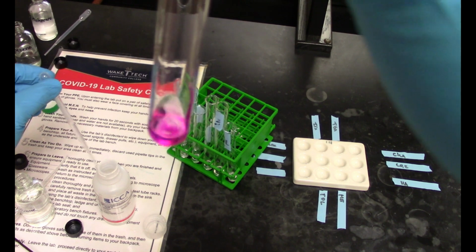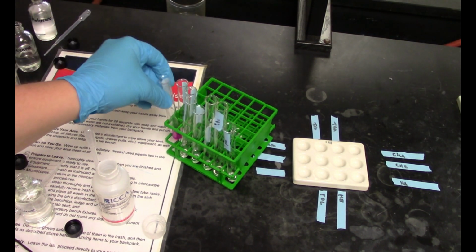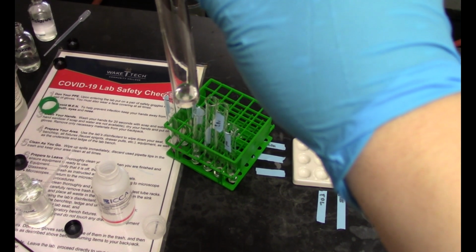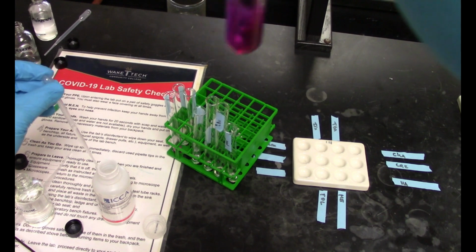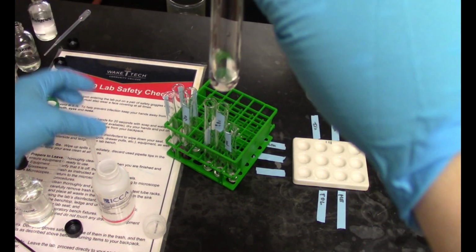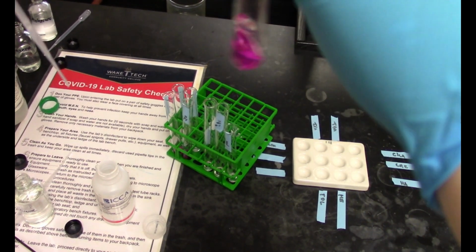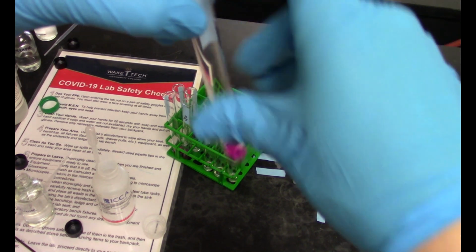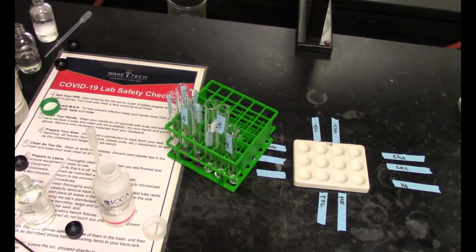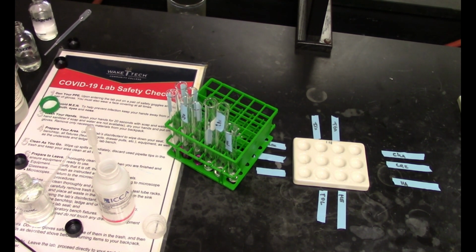So if we add a drop to the ethanol, we see it turn this pink color, indicating that the solution has gone basic. For the isopropanol, we add a drop. That's also turned our deep violet color. And our tert-butanol, add a little bit, and we also see that color change. So in the case of the compounds which did react with sodium, we see the switch to a basic solution. So that's our reaction with sodium and the subsequent effect on the pH of the solution.